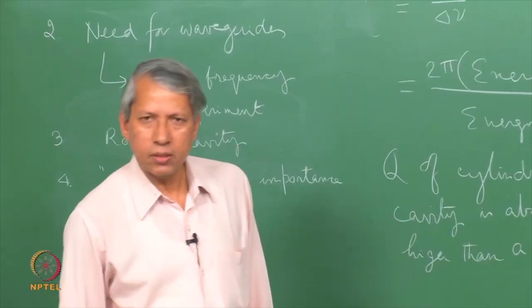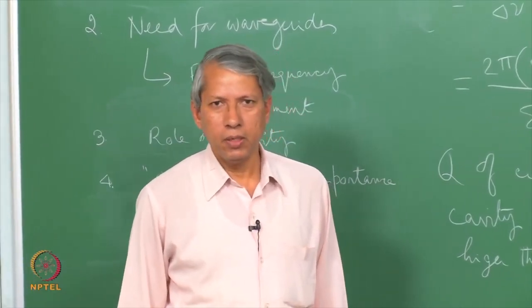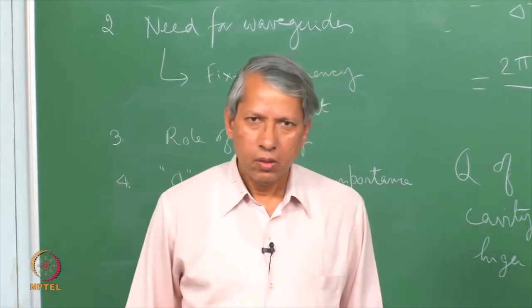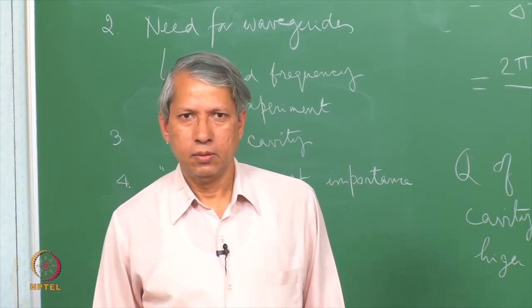We will continue our discussion on the other components of an EPR spectrometer and see how an EPR spectrometer looks like afterwards in the subsequent lecture. That's it.